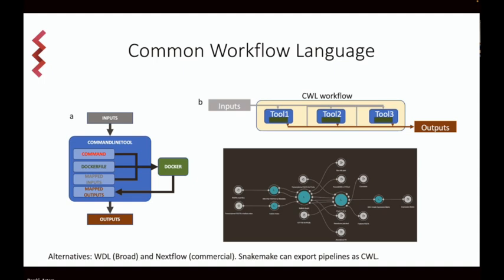So it is kind of a semi-proprietary language, but also popular, and they have a number of good pipelines. Finally, Snakemake, which is another pipeline tool, can export the pipelines into CWL, so we can get Snakemake pipelines into SciDAP.